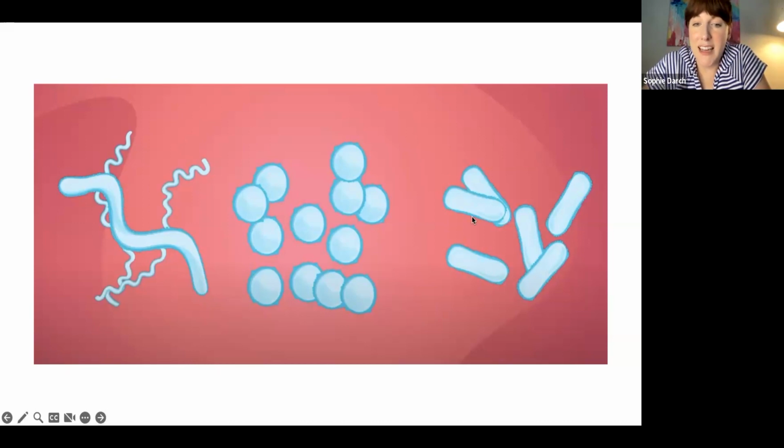So of course, to the naked eye, if you're just looking at something on an agar plate, if we grow bacteria in the lab, you might see a colorful agar plate, which is just that kind of jelly material that we put bacteria on as standard. You might see a lot of different colors, so we can see that something is growing, but by the naked eye, we can't see individual cells.